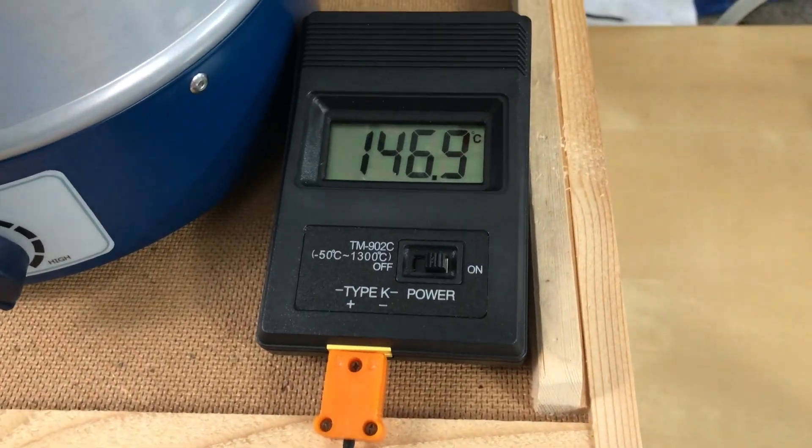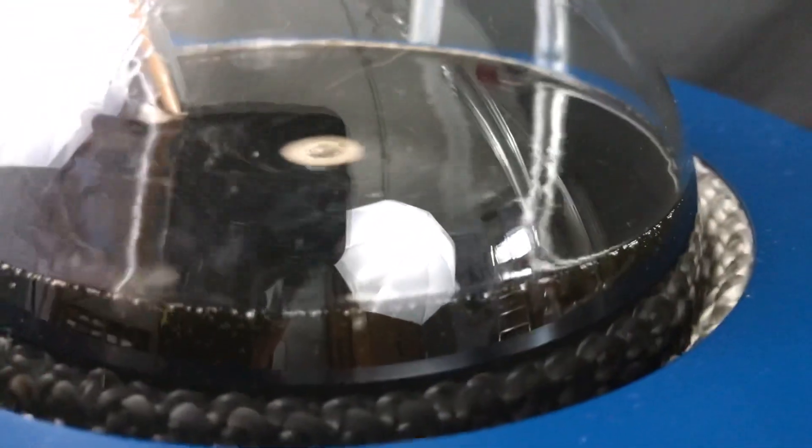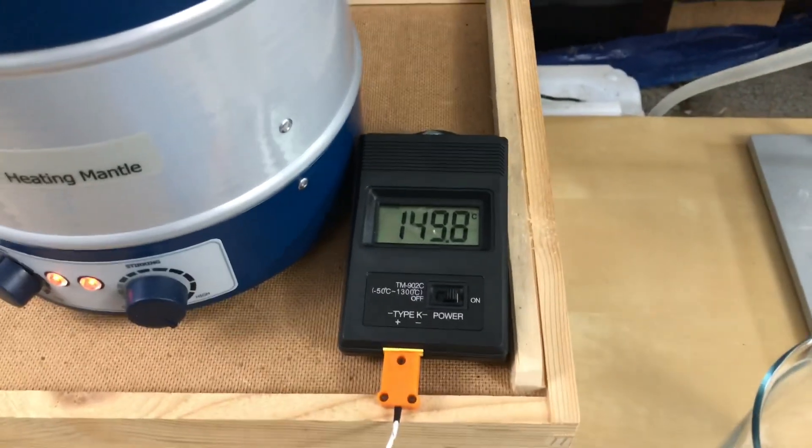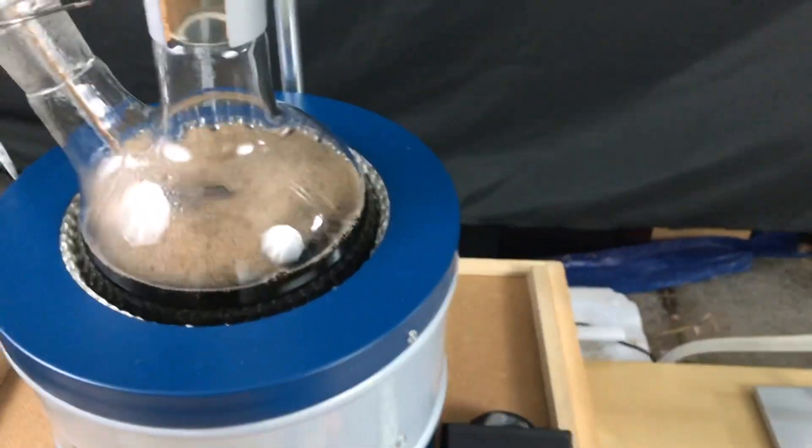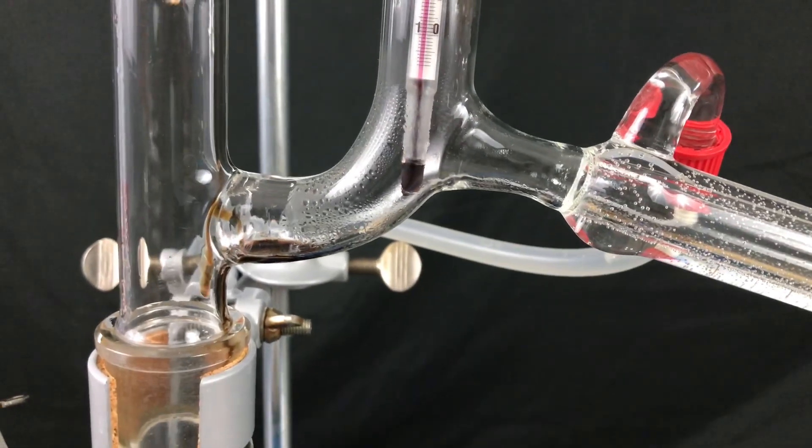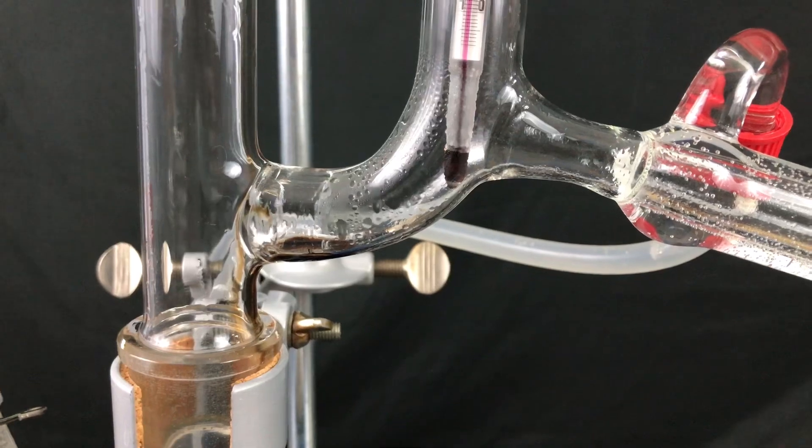At around 150 degrees celsius bubbles started to form and you can also see that our solution turned black. As the foaming increased even more I turned off the heating mantle. I didn't want all of this tar and black stuff to pass over into my condenser but we were able to see a nice and clean vapor front climbing up.